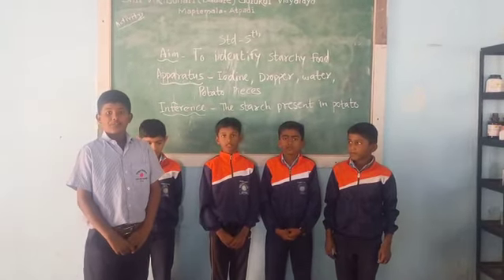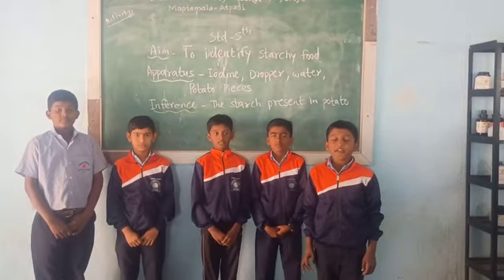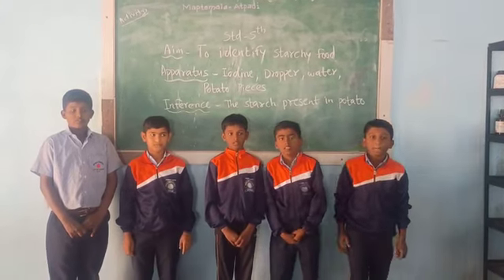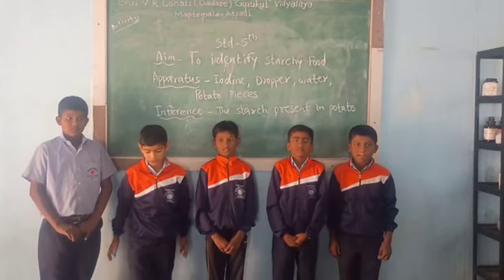The aim is to identify starchy food. This activity's apparatus needs iodine, water, a dropper, and potato pieces. This activity infers starch in a potato. Let's go to the video activity.